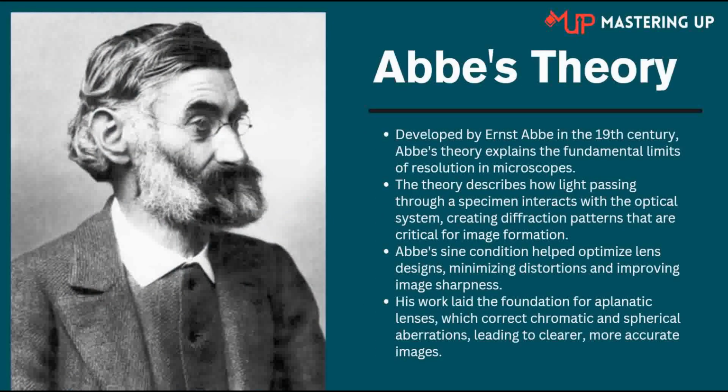Let's move on to Abbe's theory. Abbe's theory was developed by Ernst Abbe in the 19th century. He explained the fundamental limits of resolution in microscopes. The theory describes how light passes through a specimen, interacts with the optical system, and then creates diffraction patterns that are critical for image formation.